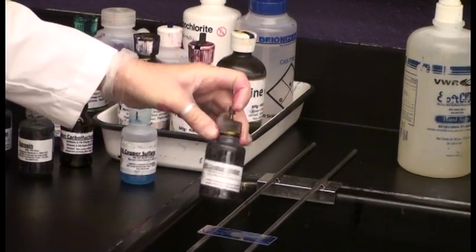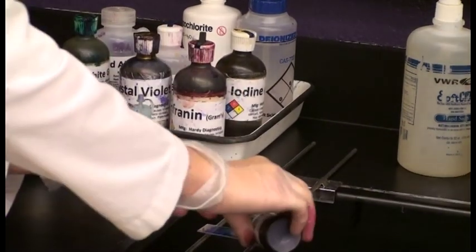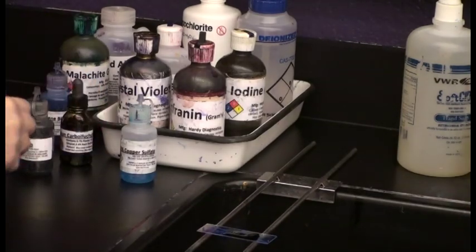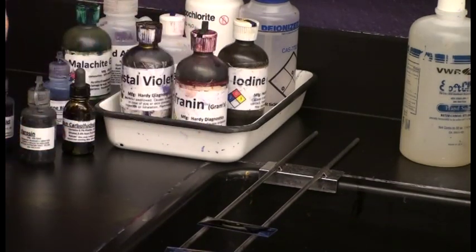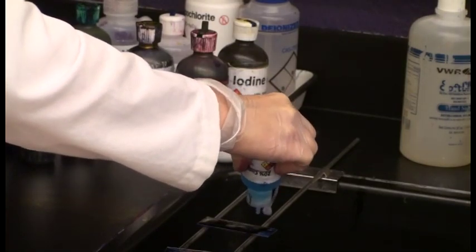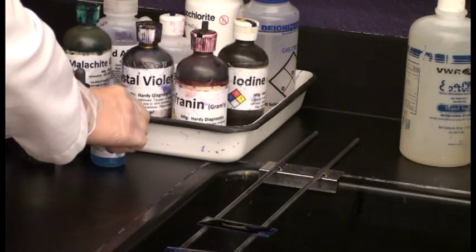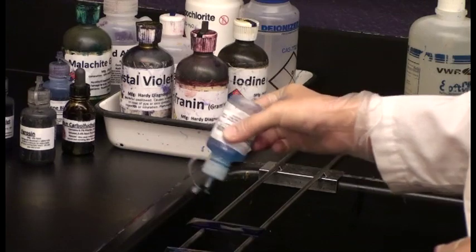To begin the capsule stain, flood your smear with one percent crystal violet. Let the crystal violet sit on the smear for two minutes. After two minutes, remove the excess crystal violet using copper sulfate. Do not rinse your slide with deionized water — it will dissolve any capsules that are present. Continue to rinse the slide with copper sulfate until the excess crystal violet has been removed.